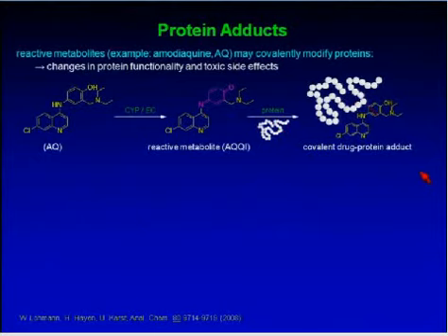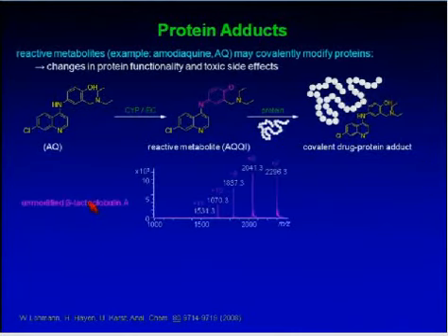Now I'd like to show you a simple example in this case first with beta-lactoglobulin A. We are doing most of our protein adduct studies first with beta-lactoglobulin A because it has just one free thiol group and it's very well accessible to mass spectrometry. So it's much better from the mass spec point of view compared with human serum albumin, but of course it's not relevant for the biological systems. So it's a very good model system for initial tests, and we always do it.